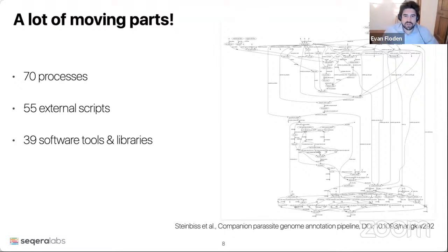It's a different tool which is being used. And you can see there's really a multitude of different tools that are a part of that pipeline. Each one of them had to be painstakingly installed on the machine that you wish to run the analysis on. Obviously, it presented a big challenge and a lot of time was spent. That essentially got placed into a Nextflow pipeline, and I'll show you the results of that in a moment.